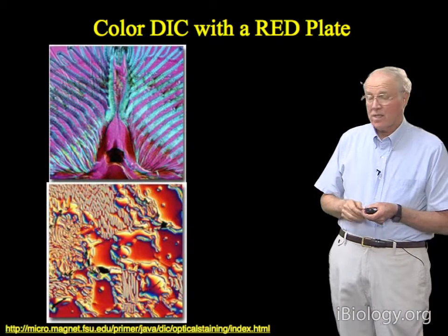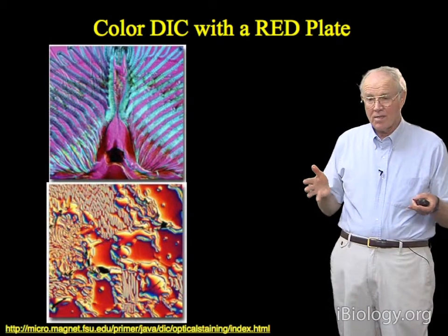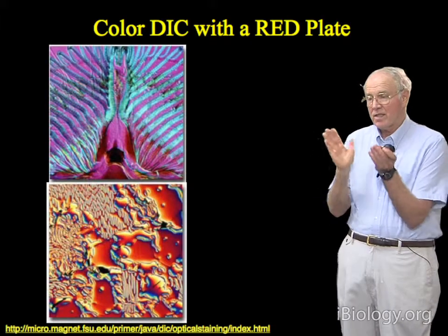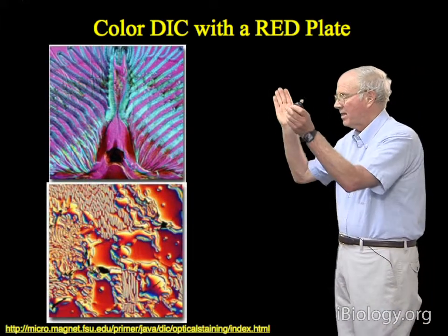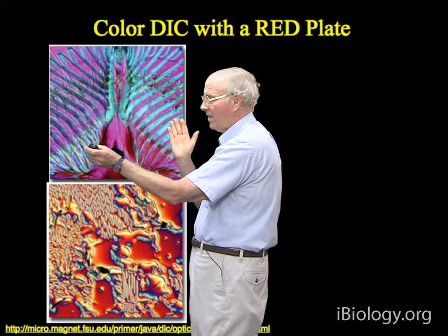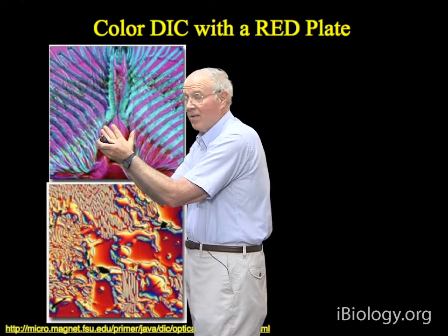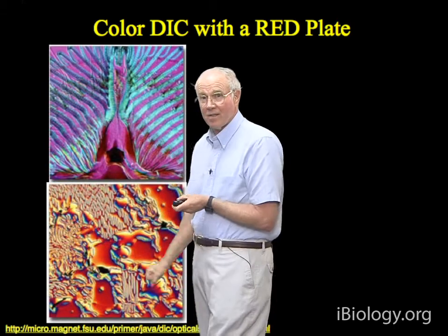And if you illuminate the specimen with white light, what happens is the background experiences a 550 nanometer retardation, which for green light brings the E and the O wave, so you're coming along and go thwomp, and one goes faster, one goes slower. But in fact, if you go a full wavelength, that's the same as lining up the two sine waves again, and you end up with the initial plane of polarization, and that's canceled by the analyzer.